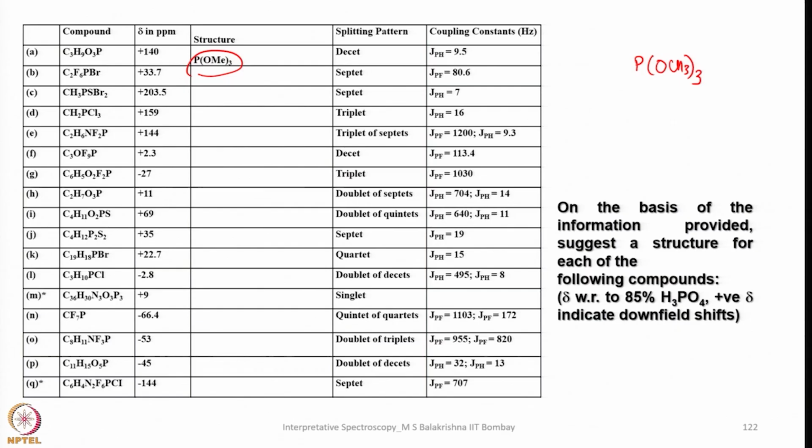It is very interesting. It covers most of the phosphorus compounds we come across, and you can use the extensive list I gave you in one of my lectures to write the structure for all of them. Once you write the structure, it is very easy to understand. And of course, here only this one is missing. Further information is also given on how each signal, the multiplet, would look like. Here we have 10 lines.